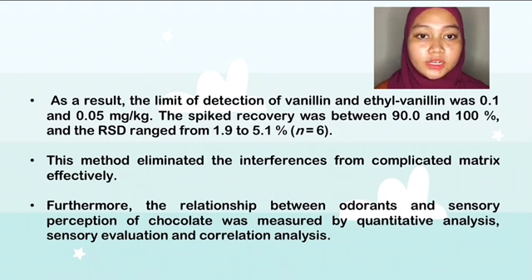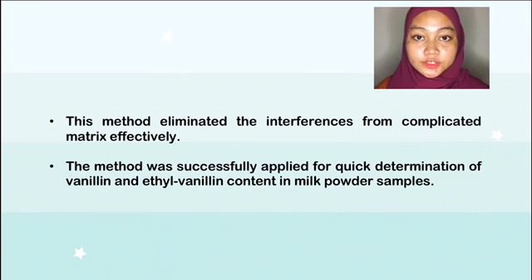Furthermore, the relationship between odorants and sensory perception of chocolate was measured by quantitative analysis, sensory evaluation, and correlation analysis. The method was successfully applied for quick determination of vanillin and ethyl vanillin content in milk powder samples.